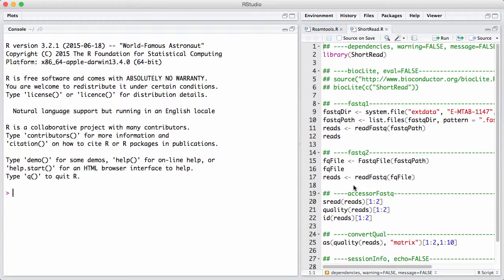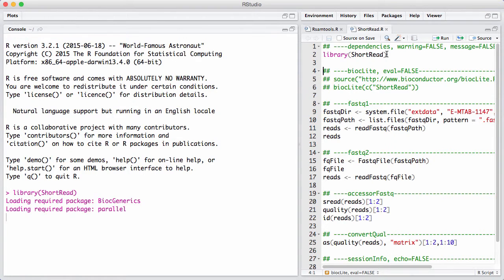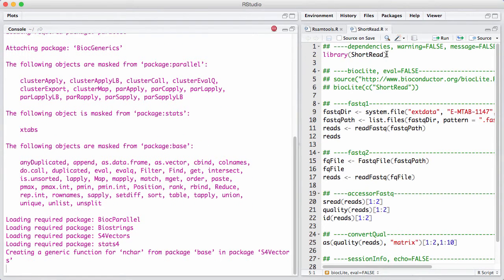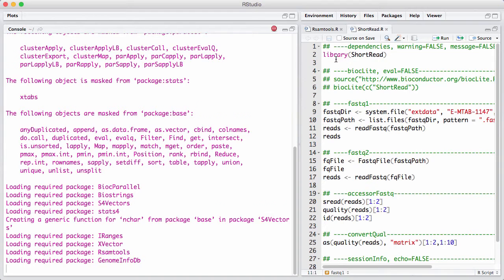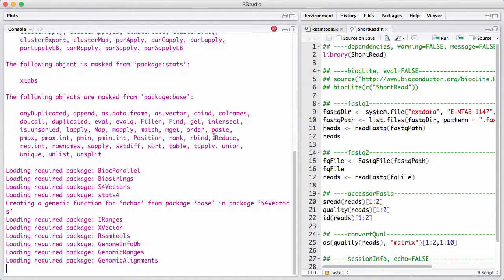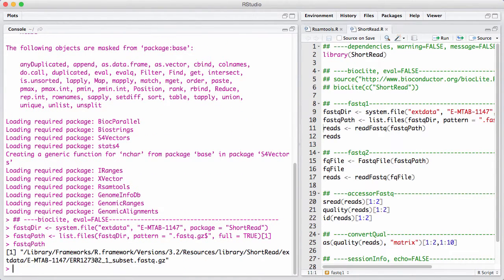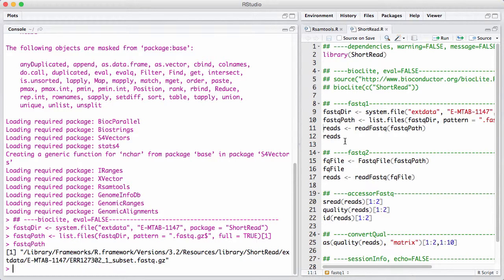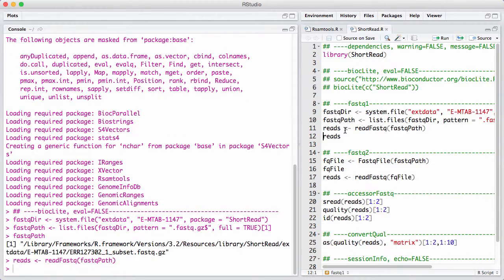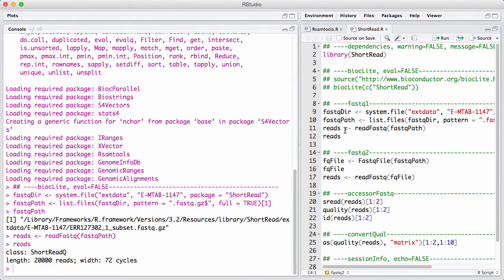So let's start by loading the package and getting a path to a fastq file that sits with the package itself for testing purposes. So this is just a pointer down to a fastq file. And we read it just by the function called read fastq, which returns an object of class short readq, which we will examine in a little bit. We can see in this case that we have 20,000 reads and each read is 72 bases long.